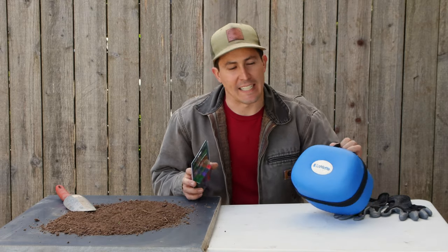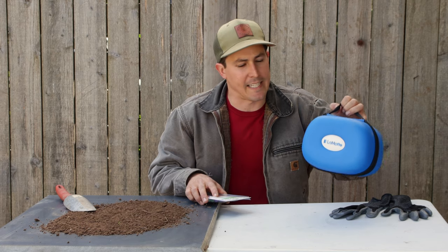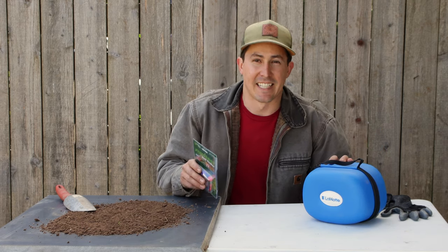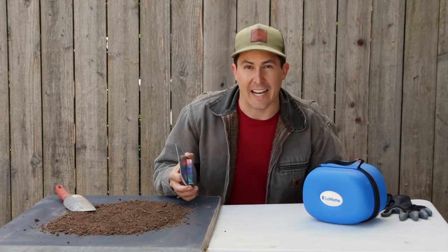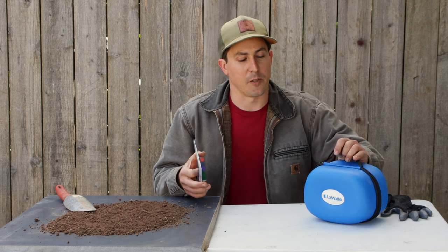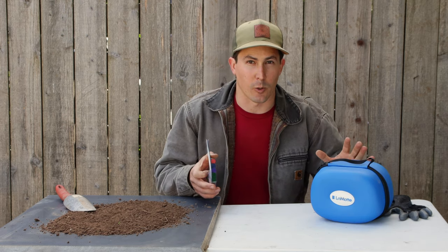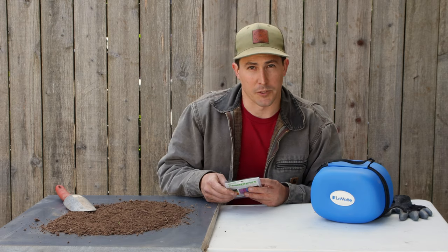Now onto my home test kits. I'm going to be testing the Rapid Test Kit and the LaMott Garden Soil Test Kit, and I'll be following the directions on both of these kits exactly. But rather than making you wait through 30 minutes of that, I'll be cutting through and just showing you the general process. It's important that if you get either of these kits or any other soil test kit, follow the instructions exactly as they're given in order to get the most accurate results.